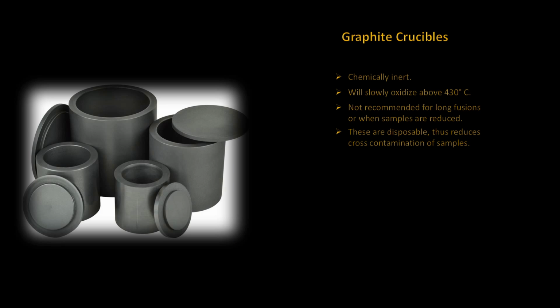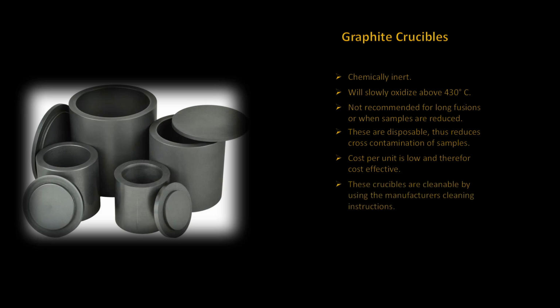Now, these units are disposable. Disposing after use reduces the possibility of cross-contamination of your samples. However, graphite crucibles are also cost-effective due to their low cost per unit. Now, these crucibles may be cleaned. Just follow the manufacturer's cleaning instructions.